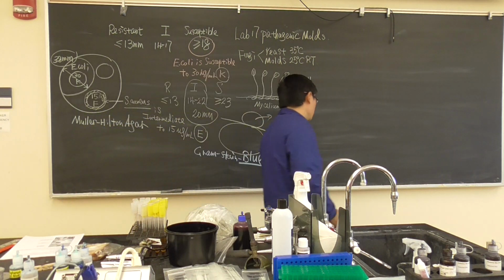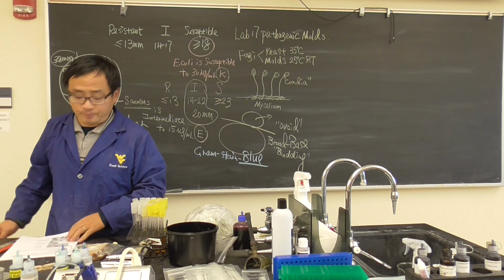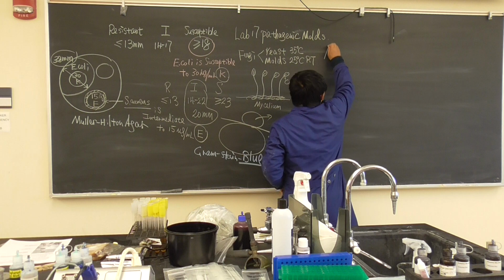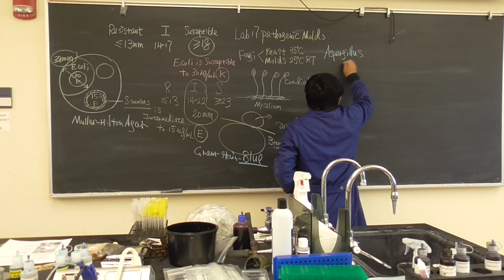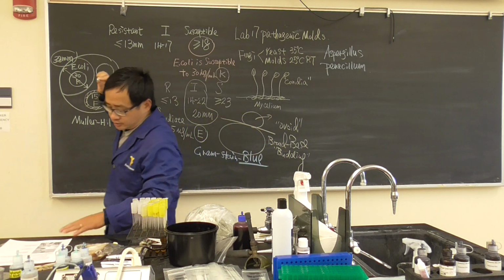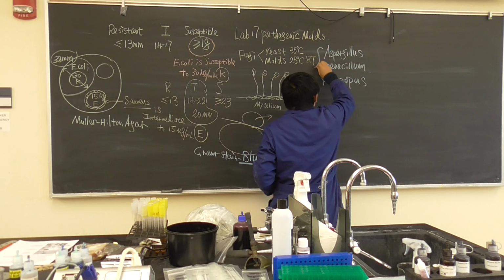So today we wanted to see this molded bread. What type of pathogenic molds are they? Basically, we have three categories. It's on the first page: Aspergillus, Penicillium, and the last one is Rhizopus. What does it look like, basically, which one?